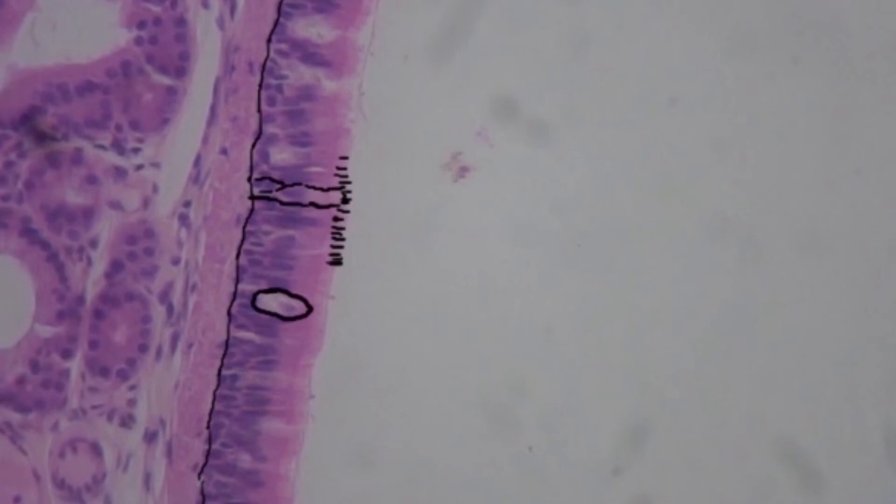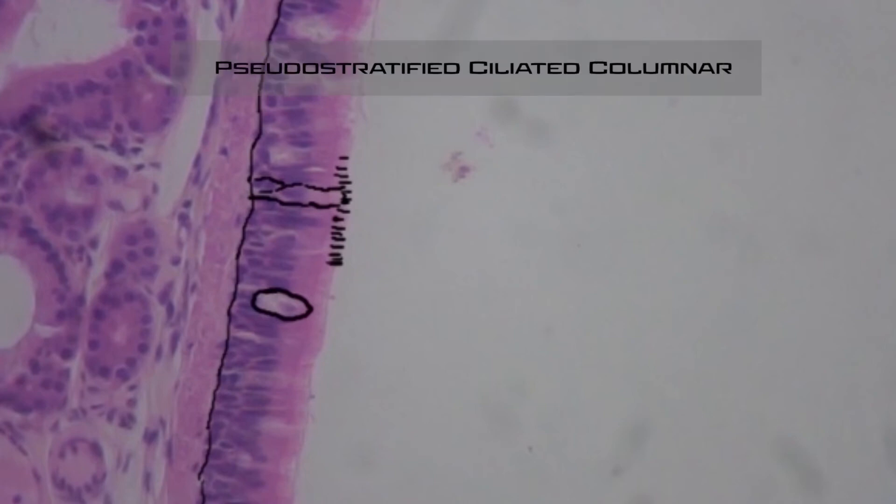Also here, you can see goblet cells, which release mucus to help move things we breathe in out of our lungs and trachea. We also see cilia on top of the cells — little hair-like projections — which move all the mucus upwards, getting rid of dirt or bacteria we breathe in using the cilia and the mucus created by the goblet cells. The majority of these pseudostratified cells are columnar, so we have a very special name for this type: pseudostratified ciliated columnar cells — pseudostratified because they look stratified but aren't, ciliated because they have cilia, and the majority are columnar in shape.